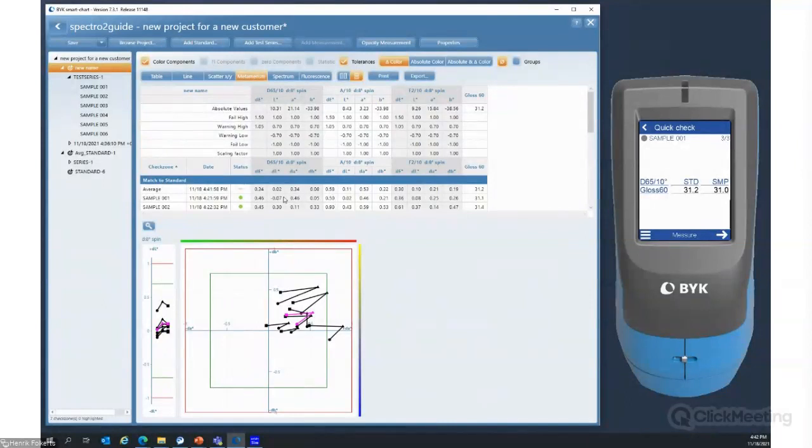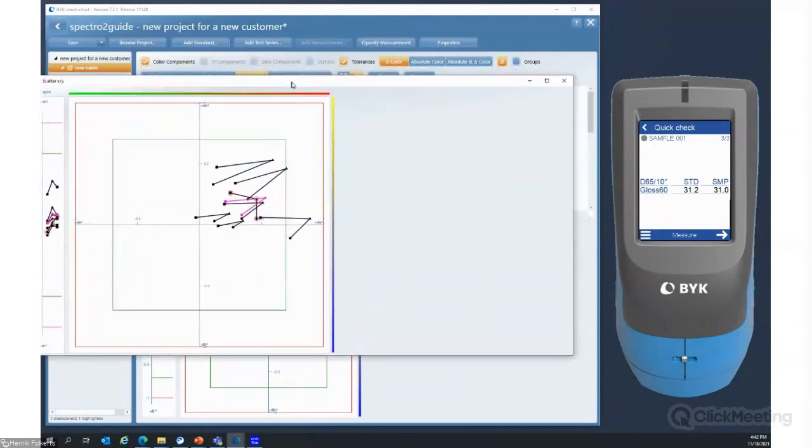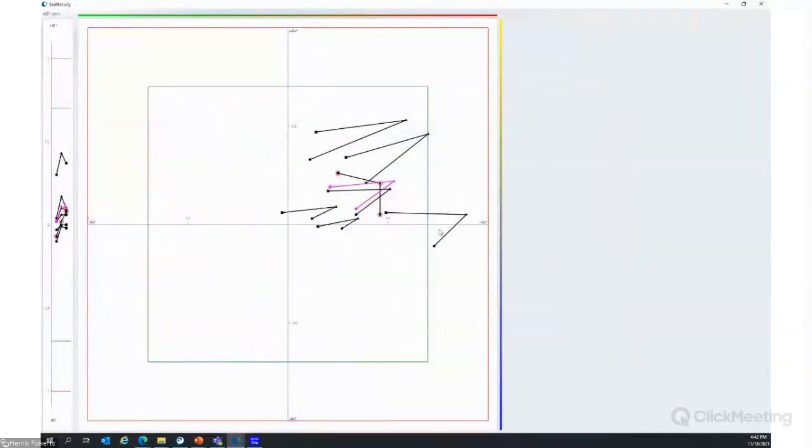And now you see a setup. I will try to make it a little bit bigger so that it's easier to see. So this here belongs to one sample. When I do a mouse roll over, you see this is sample number 2, the analysis for illuminant F2.